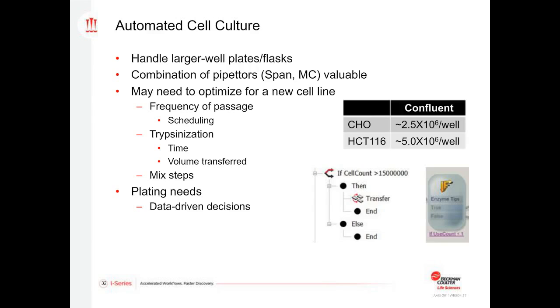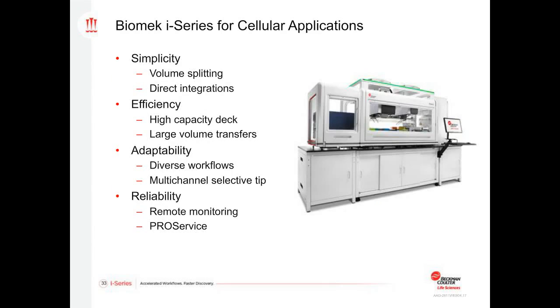So that basically wraps up the talk. We'll try and bring it back to the simplicity, efficiency, adaptability, and reliability, and see if we've hopefully shown some examples of how these apply to cellular applications. When it comes to simplicity, having that volume splitting feature, where it really doesn't necessarily care what volume you need transferred, you don't need to put in any sort of conditional statements or scripting.